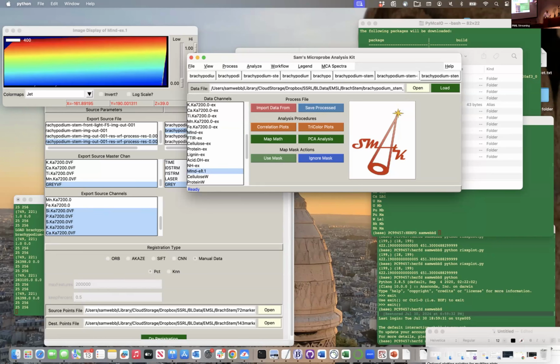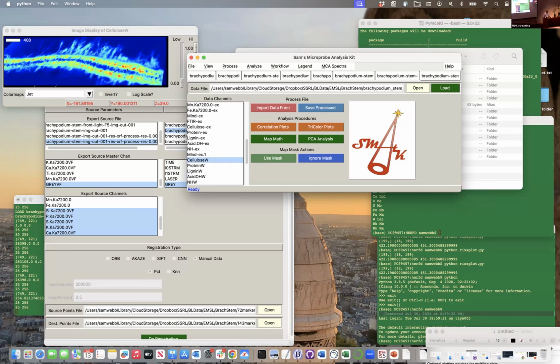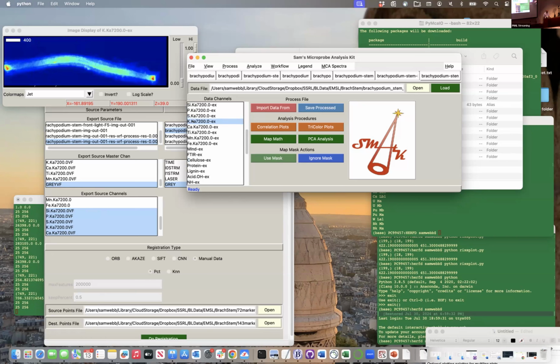Transfer, here's the infrared movement onto that. Now, the infrared one, I'm going to say was a little bit trickier because I didn't have an optical image to work with. So I had to use infrared corners. I used the same corners of those data points together to do that fusion. It did finally work. But we can see that there's our infrared data, and it's got that little warp profile to it. But we are matching our profiles the best we can right now with that.